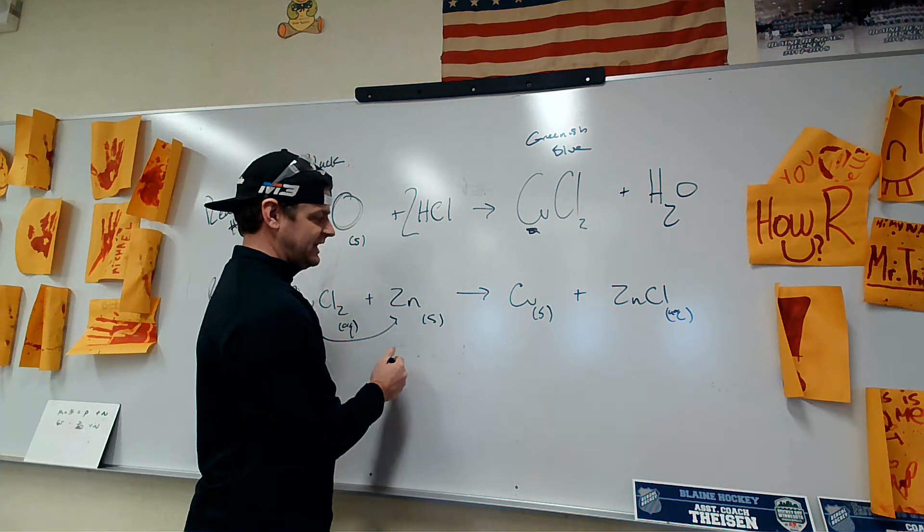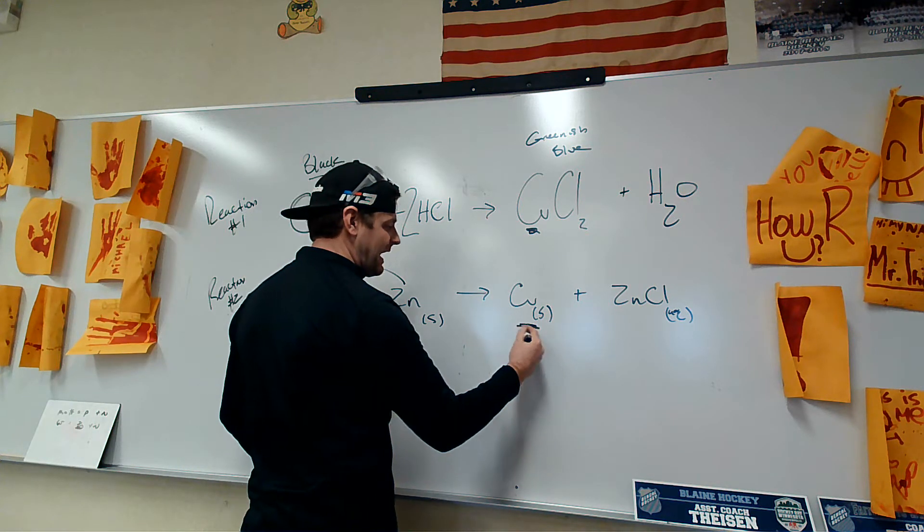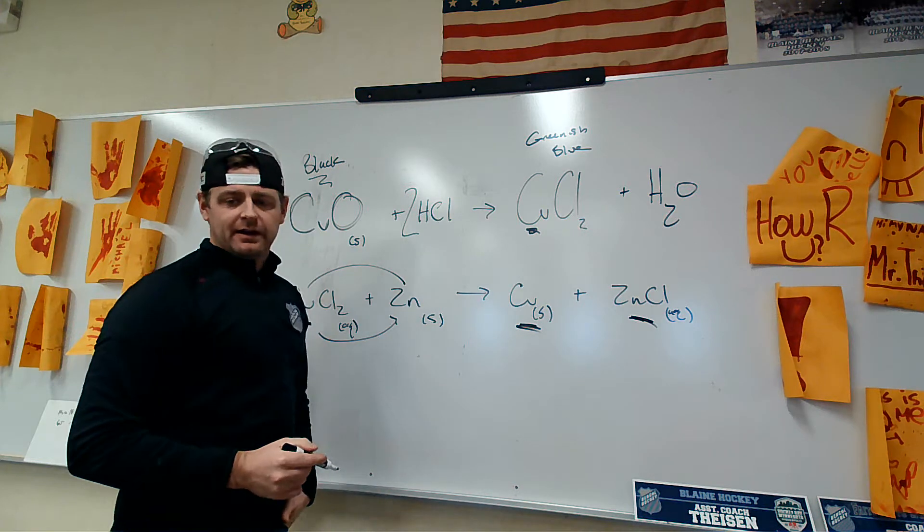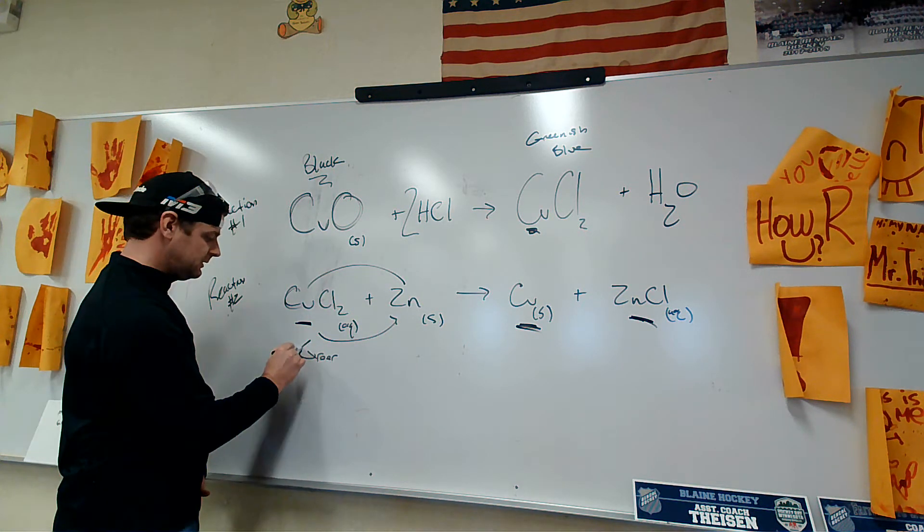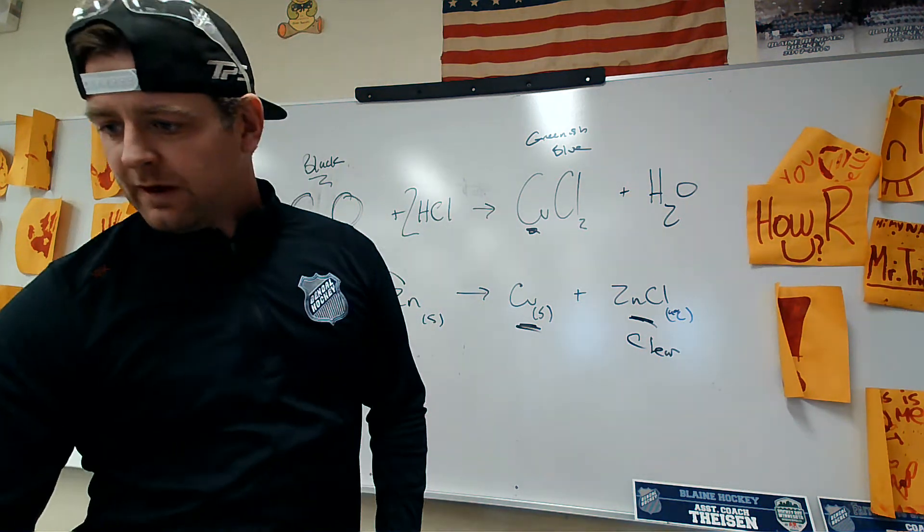When I add the zinc, it's going to switch with the copper. We'll get copper by itself and zinc chloride as a solution. The solution is going to go from green to clear, and you'll see that happen as I do it.